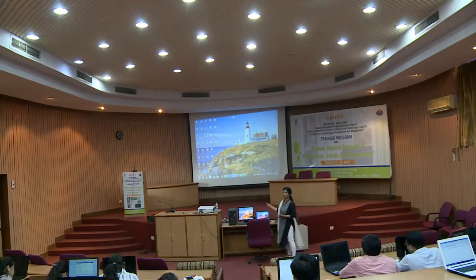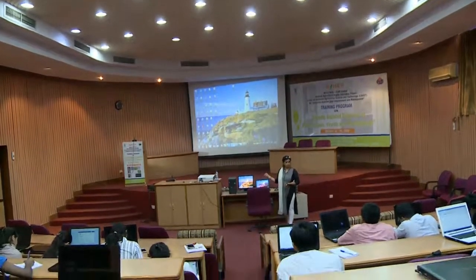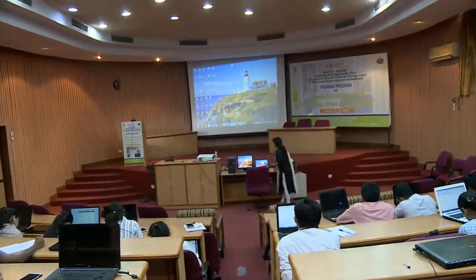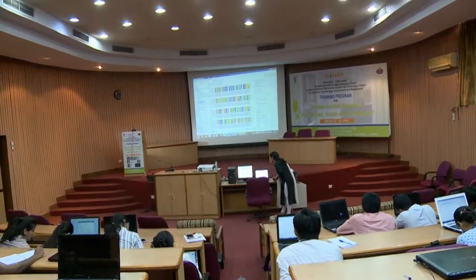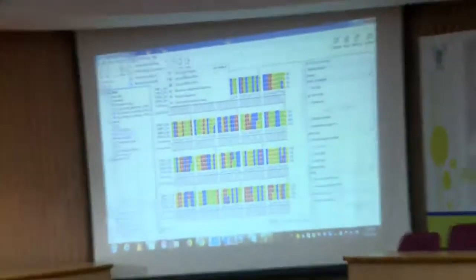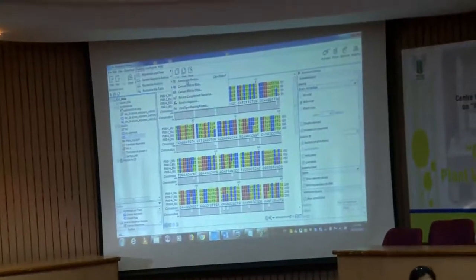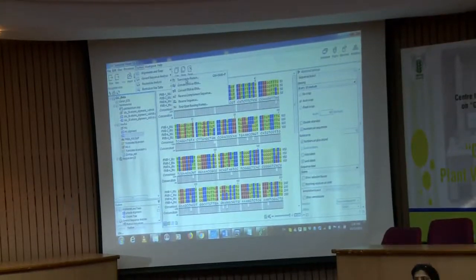Here also in CLC also, you can convert the nucleotide sequence to that protein version. You can see this option is there now, I had shown you. Translate to protein. So with this format also you can translate into a protein sequence, correct.